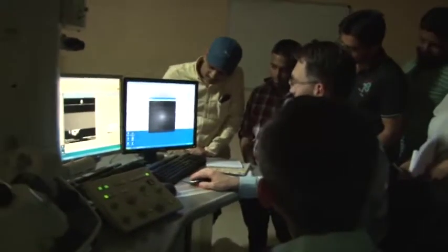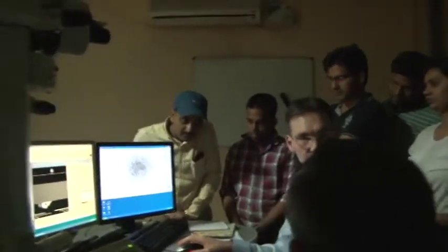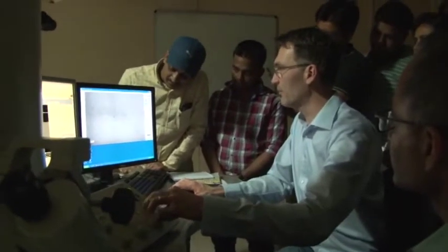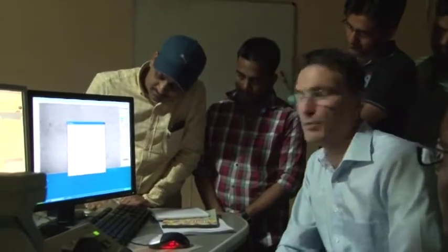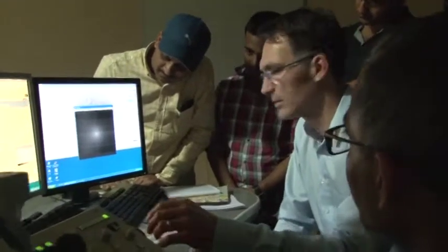And in that Fourier transform, you directly see astigmatism. So it's far easier than just using the fringes, which are for coarse alignment. Now it starts the FFT. And you might just detune or misalign.